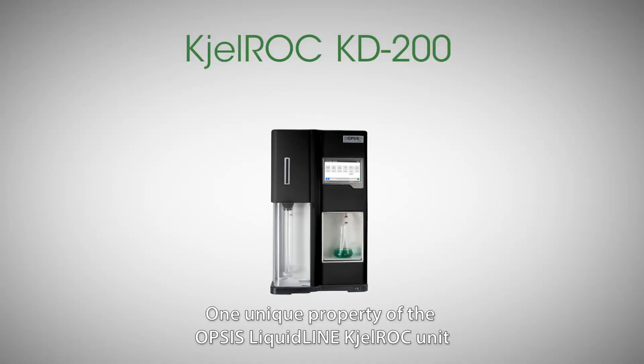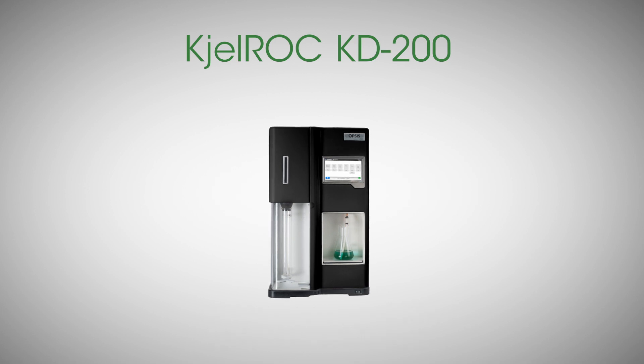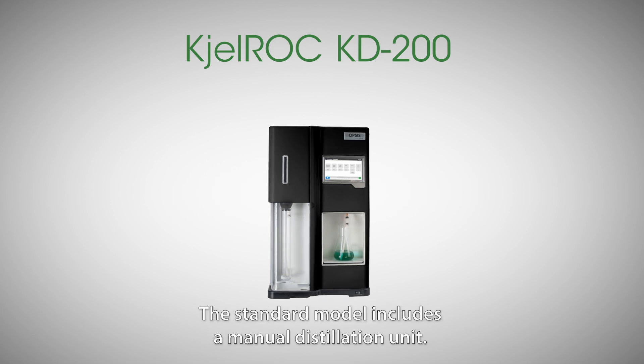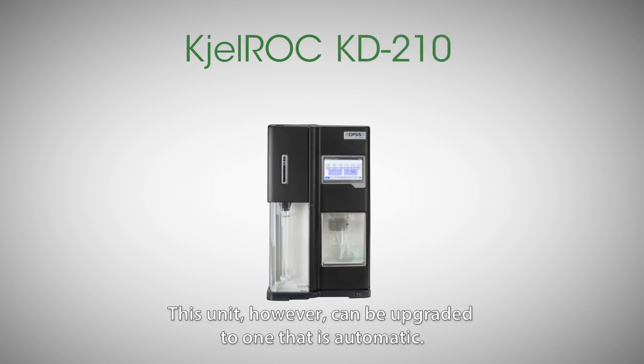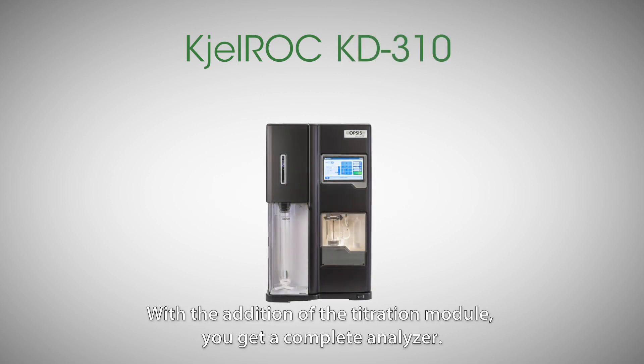One unique property of the Opsys Liquidline Shellrock unit is the ability to upgrade the analyser in multiple steps. The standard model includes a manual distillation unit. This unit, however, can be upgraded to one that is automatic. With the addition of the titration module, you get a complete analyser.